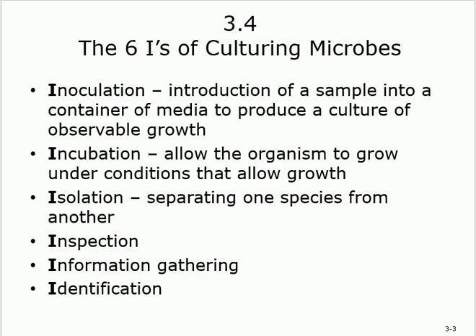So how to do a culture? We are doing a culture. What's a culture? You take a specimen that contains organism, and then you put it on a medium. You allow it to grow. You study it. You identify it.